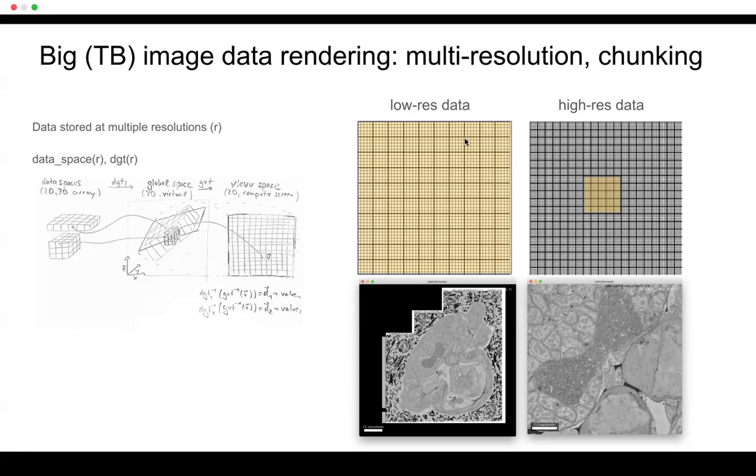Now if you zoom in, actually two things happen. First of all you switch now to a higher resolution version of your data. So here in the data space you would now access a different array on your hard disk which I indicated here with these finer voxel spaces. And a second important thing is, and this is where the chunking comes into place, you don't want to load everything right. You only want to load the zoomed in region that you're looking at. And this is computationally only efficiently possible if your data is chunked properly. So and here the chunks I try to indicate with these bold little blocks. This is how the data is basically sitting for example on your hard disk in a way that I can efficiently say I only want to load these chunks and not the others.